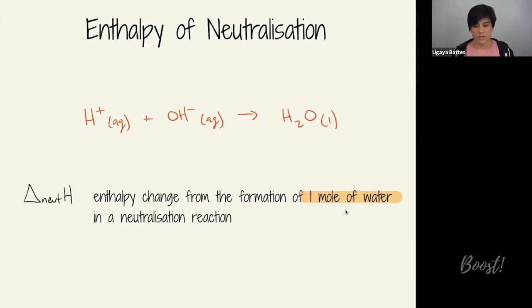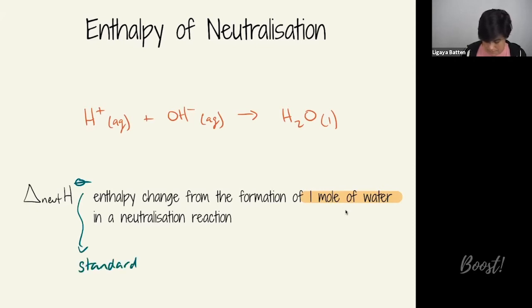And therefore the enthalpy change of neutralization is always going to be looking at the formation of 1 mole of water. If you're comparing an experimental value for enthalpy of neutralization with a theoretical value, i.e. something that you're reading out of a data booklet or a chart that you've been given, where you're usually given the standard enthalpy change of neutralization. And just remember that this symbol means standard conditions.